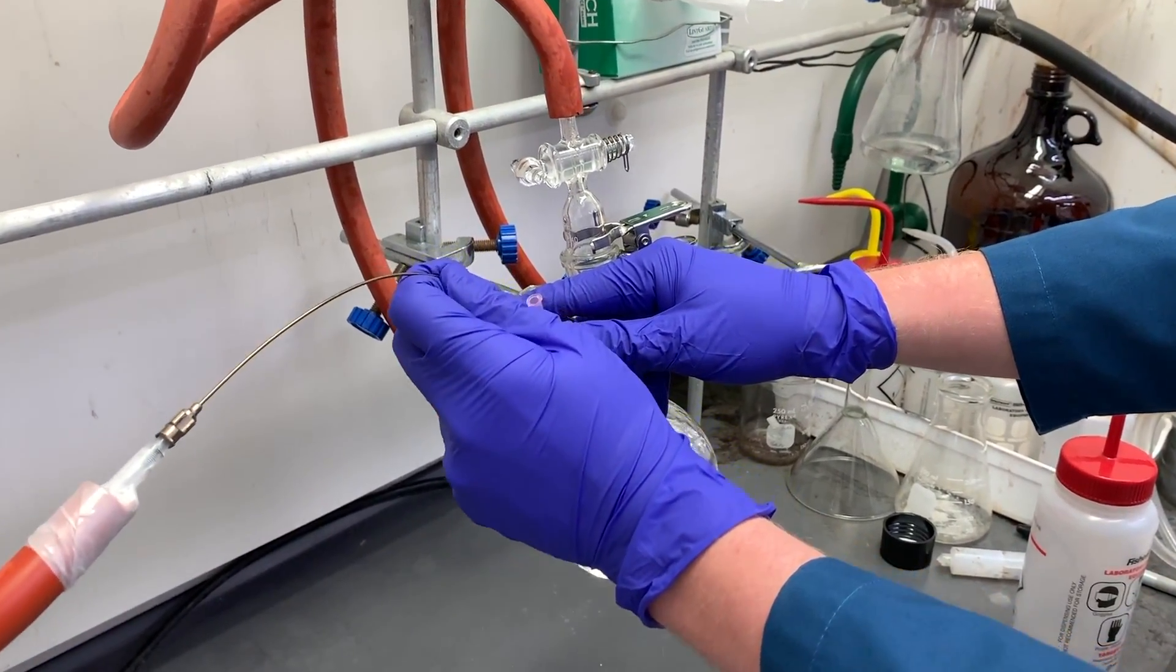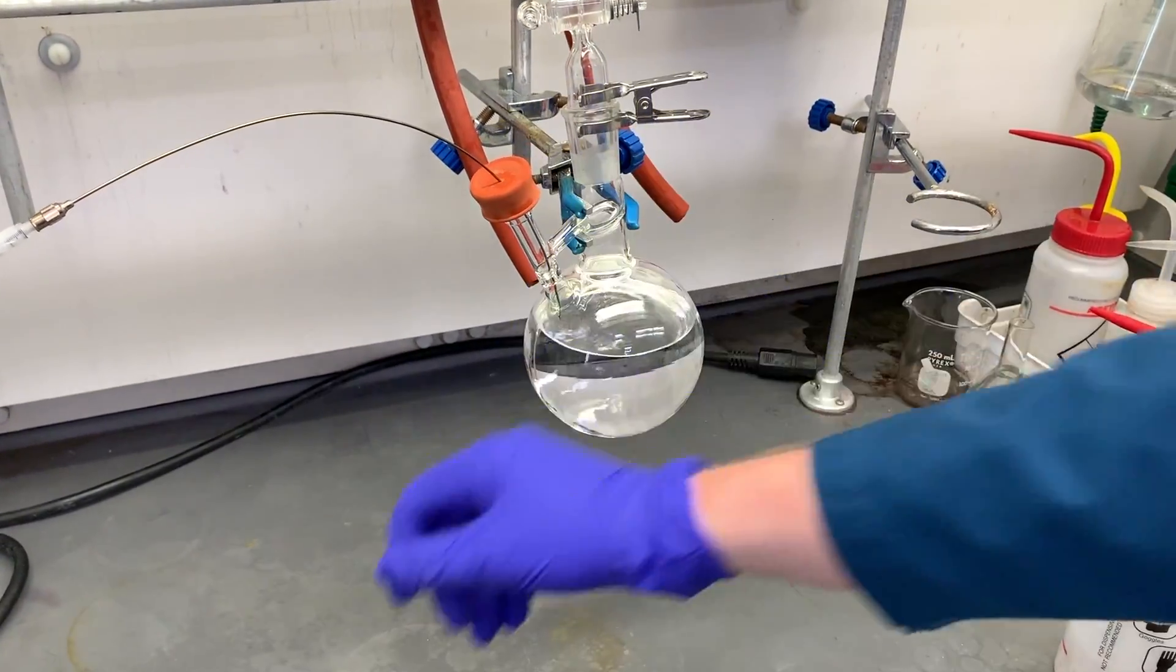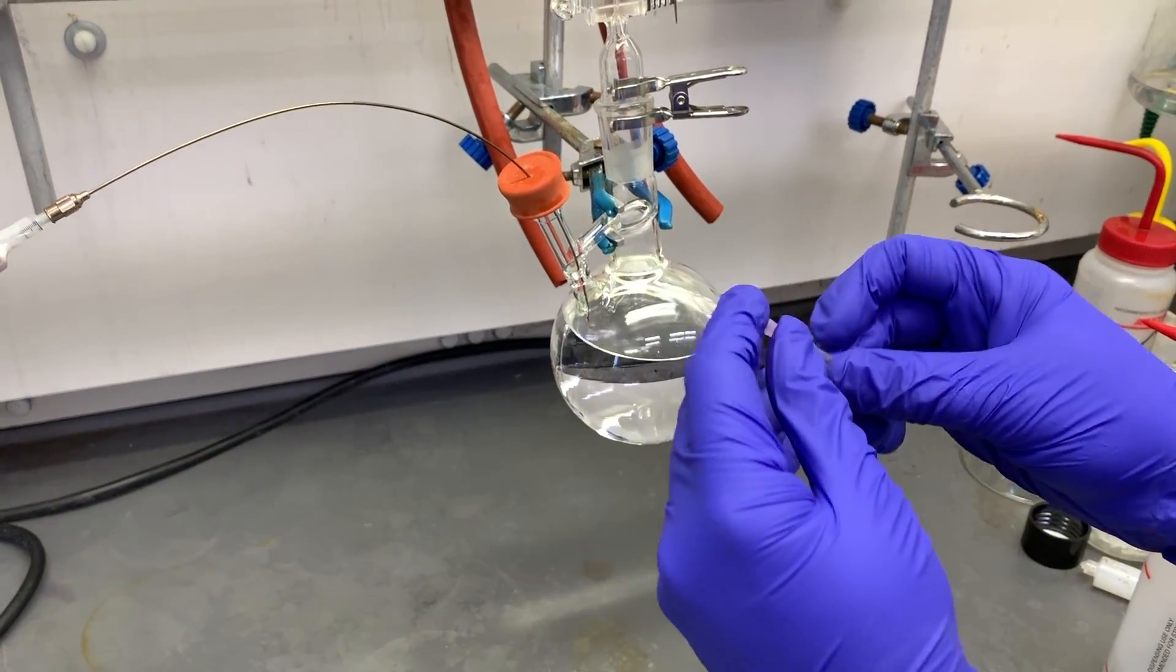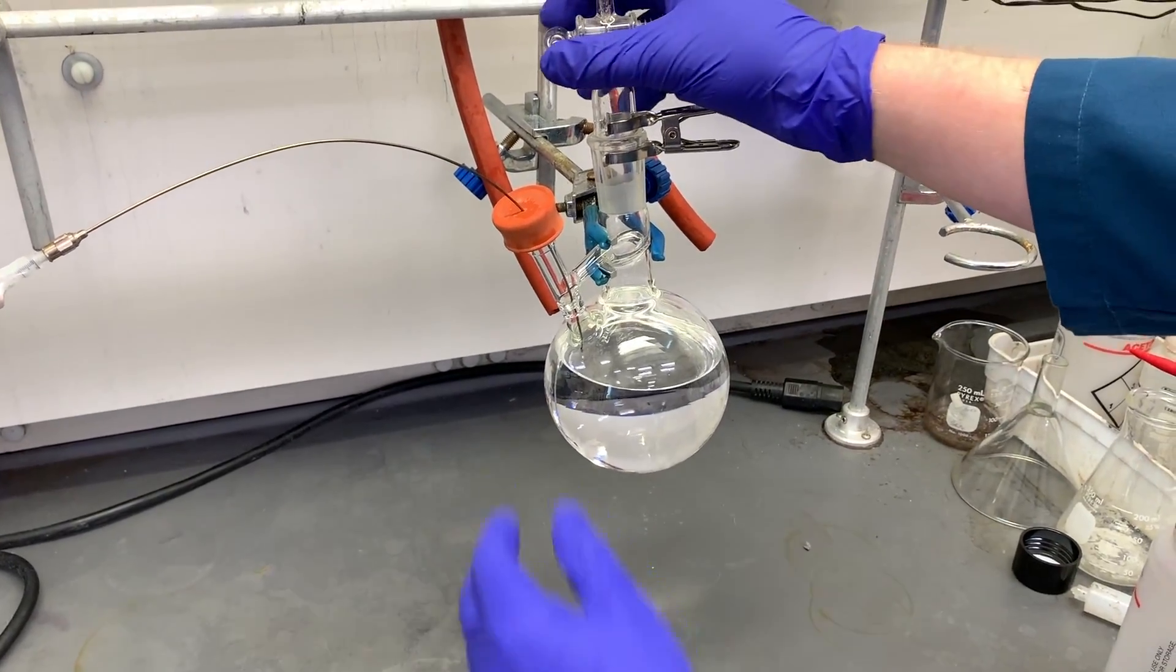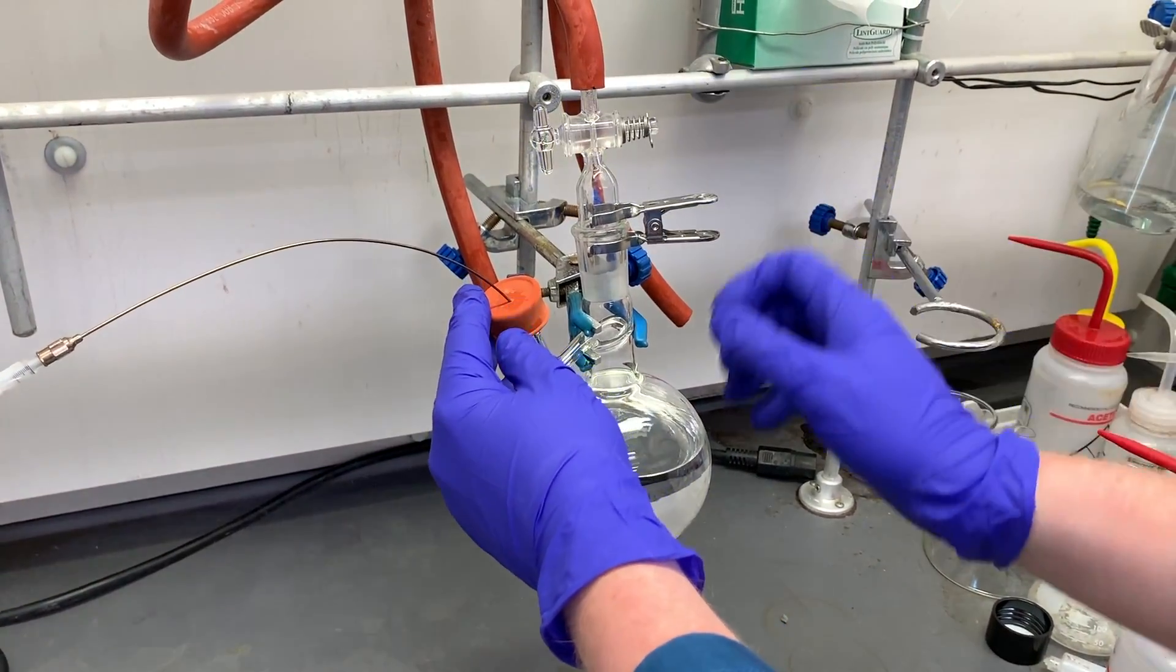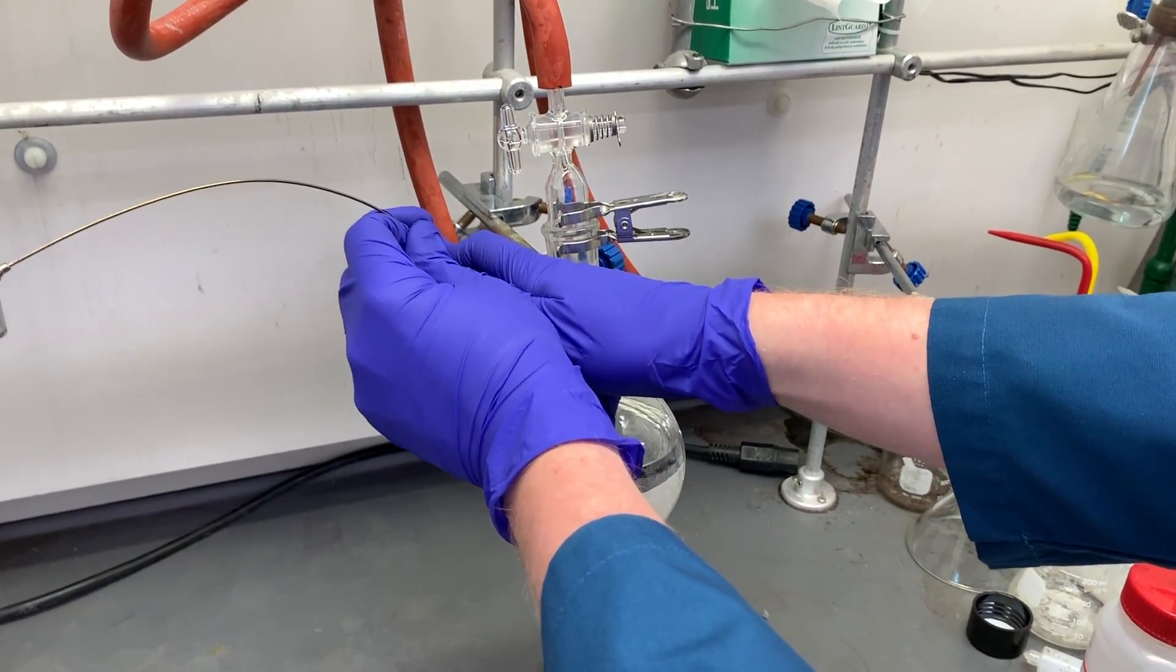After 20 minutes, pull your long needle up above the surface of the liquid while keeping it still inside the flask. Remove the pressure relief needle and then reopen the nitrogen inlet to the flask. You can now remove the long needle and the septum.